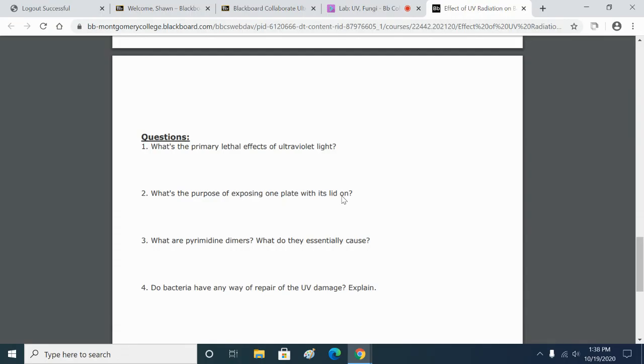In many fume hoods, the way they work is that when you're finished, you turn a UV light on in the fume hood and leave it on all night long. And so when you come back, the fume hood is nice and sterile. If you left some culture plates in there, you would have killed all your bacteria. So it's nice to know whether or not the polystyrene actually blocks UV to protect them, because if it doesn't, you may need to take some extra precautions to protect your cultures if they might be exposed to UV light.